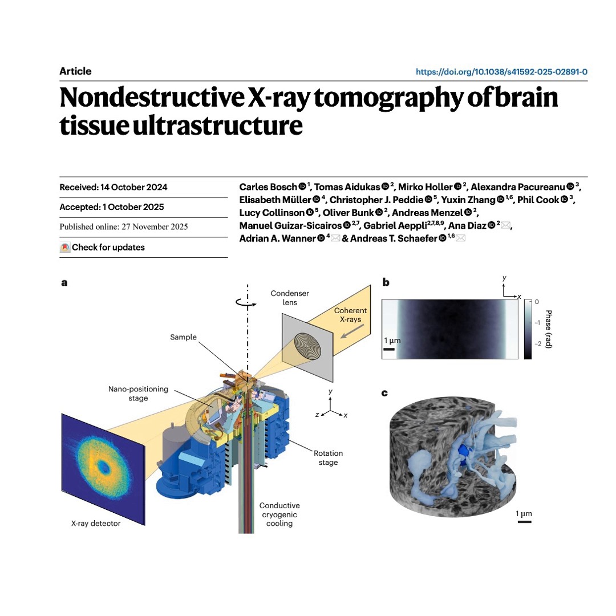And how reliable was the synapse identification, comparing the X-ray images to the ground truth from the FIB-SEM? So they ran quantitative analyses. They had expert annotators blindly identify synapses in the X-ray data. In the lower dose samples, the ones in the traditional EPON resin, they achieved a recall of 65%. So they correctly found about 2/3 of the true synapses. Yep. Decent, but there's room for improvement.